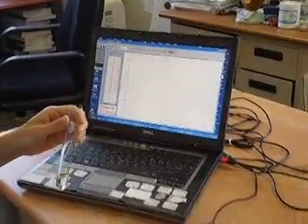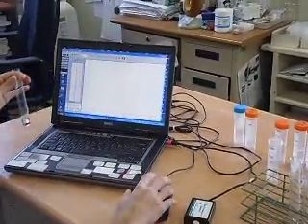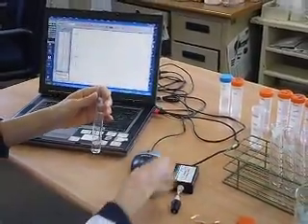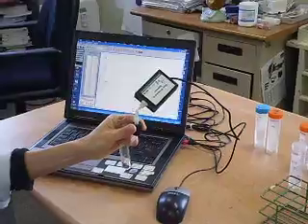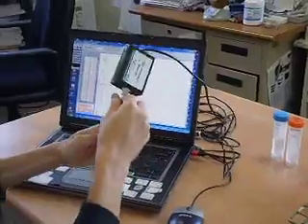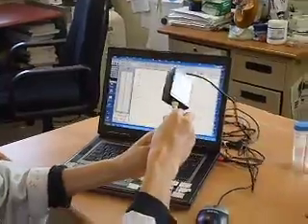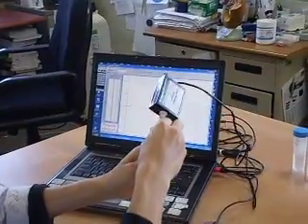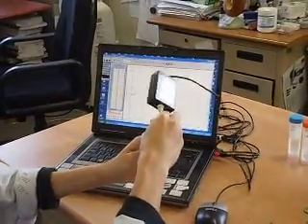So we're going to start the reaction now. The reaction will start immediately when I add the magnesium strip, and the pressure will start to build up. I'm going to add the magnesium strip, and immediately put in the gas pressure sensor and make sure this is airtight. I'm going to throw in the magnesium strip now. Throw in. Pressure starts to build up. Pressure is increasing now from 101 to 111, 112, now 113 kilopascal.